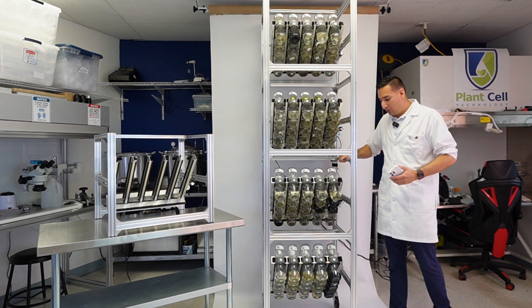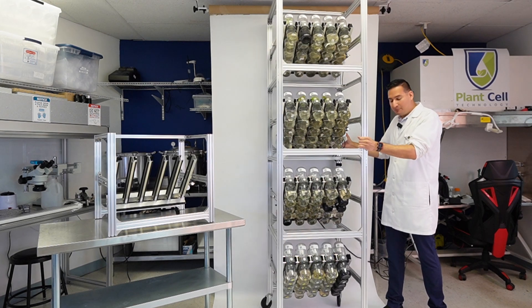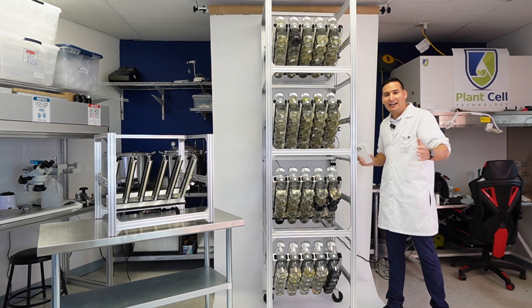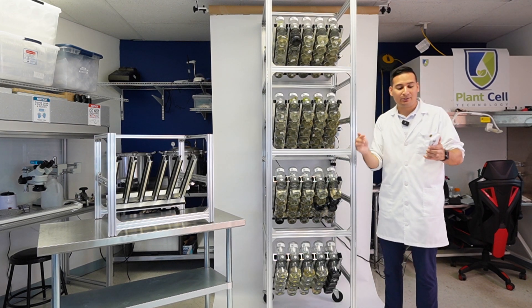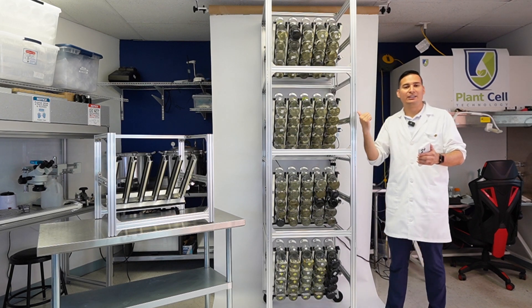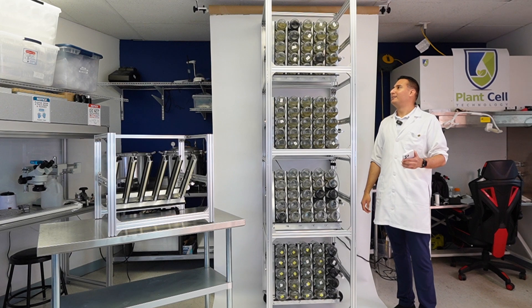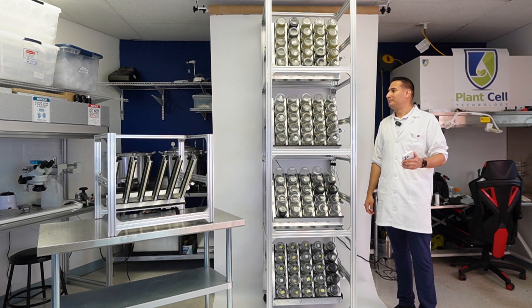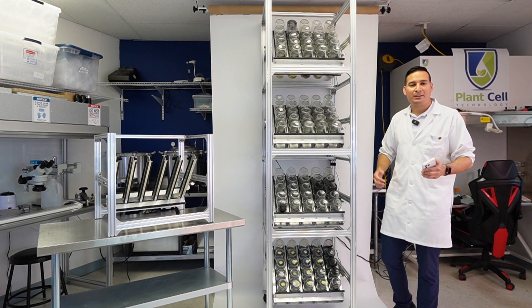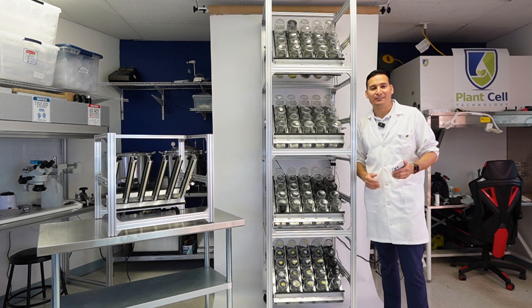The BioTill is also on wheels, so you can fairly easily move it around even when it's full. And again, since it's fully automated, I just click a button and all 25 biocouplers move at the same time. With four units stacked, I just flipped 100 temporary immersion bioreactor systems — something you won't see anywhere else with this level of space efficiency.